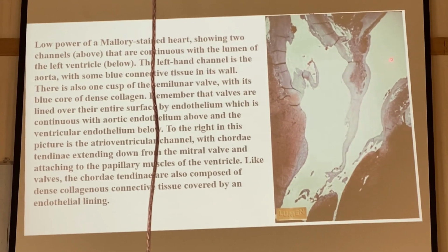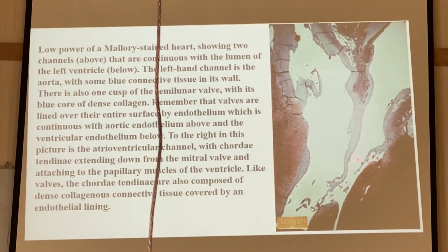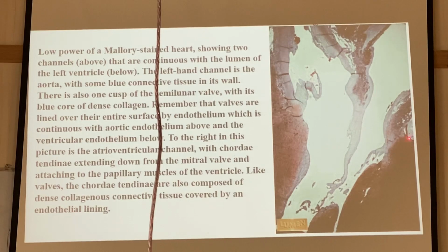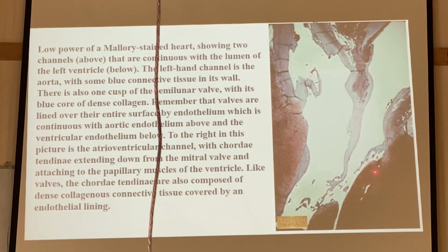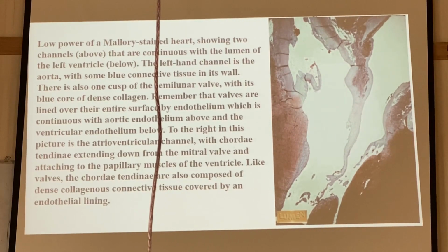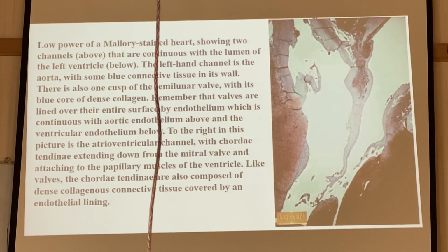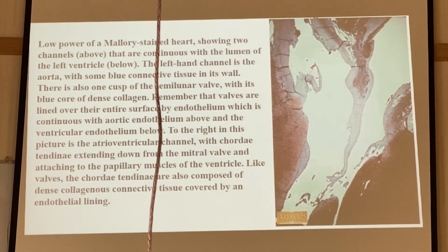And this area on the right is the atrioventricular orifice opening into the left ventricle. The valve guarding this orifice is the bicuspid valve, or mitral valve.